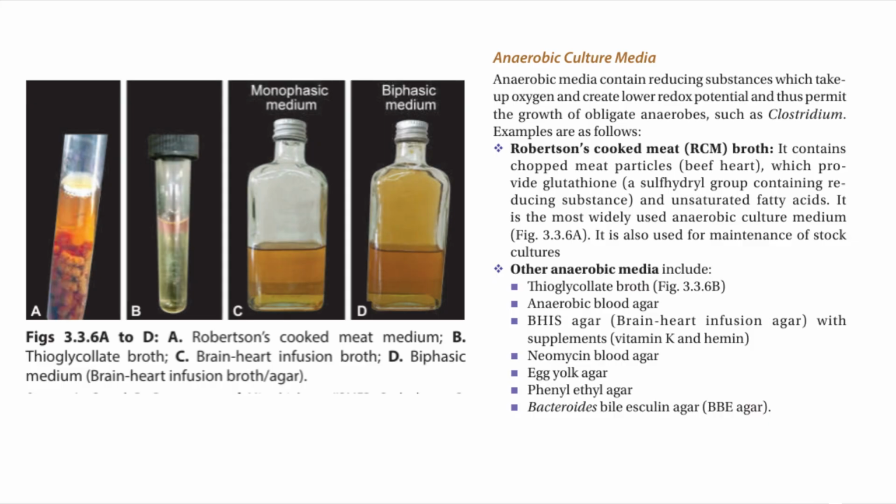Why? Because those chopped beef heart particles at the bottom provide glutathione, which is this crucial reducing substance that gobbles up oxygen and creates the perfect low-oxygen environment. You can also use thioglycolate broth, which does a very similar job.